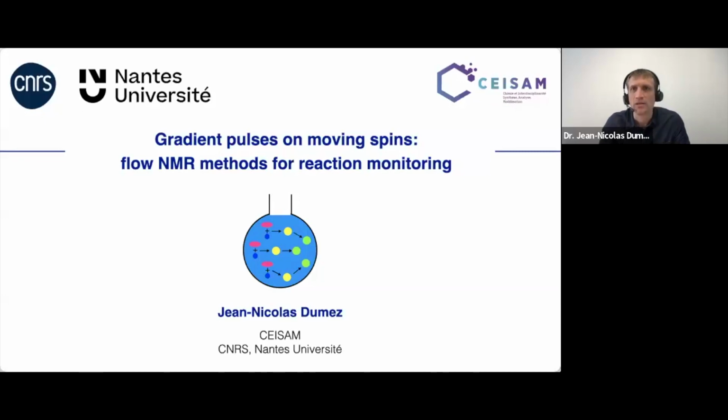So there are different aspects that I will cover, and I will also like to introduce the general concepts that are useful for the understanding and design of a gradient-based method for flow NMR in the spirit of a tutorial presentation.